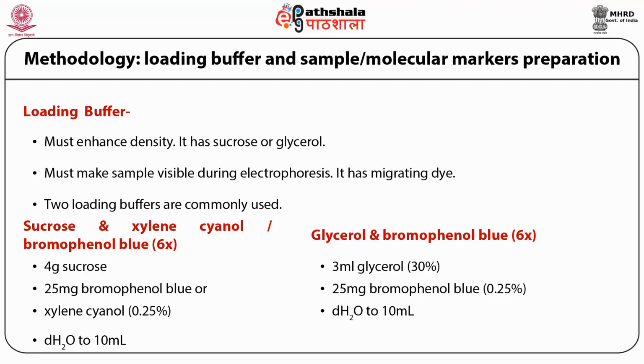The size of bacteriophage lambda DNA is 49 kilobase, which on action of restriction enzyme generates fragments of 21.80 kb, 7.52 kb, 5.93 kb, 5.54 kb, 4.80 kb, and 3.41 kb. These fragments can also be used as molecular markers. These are loaded to one of the wells in agarose to allow correct determination of the size of DNA in the sample.